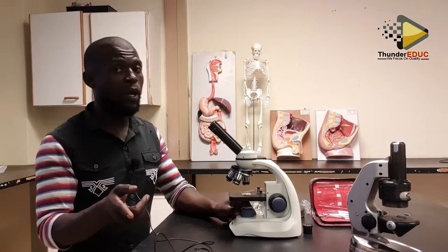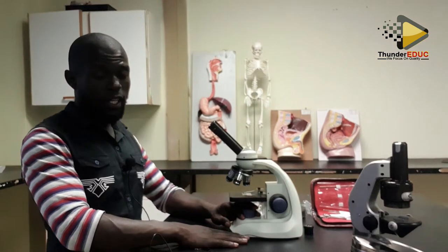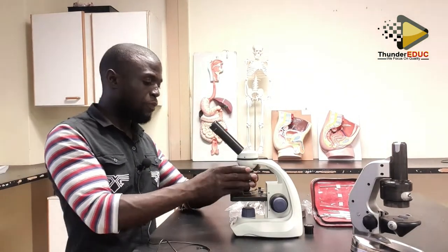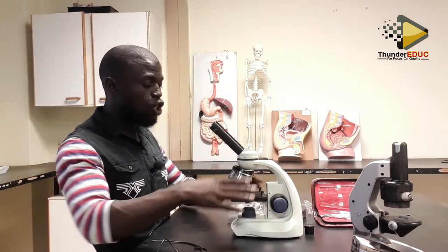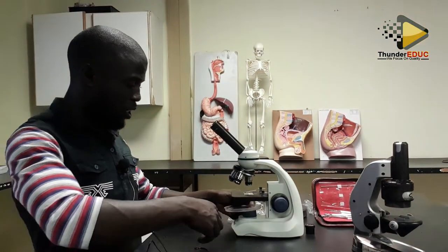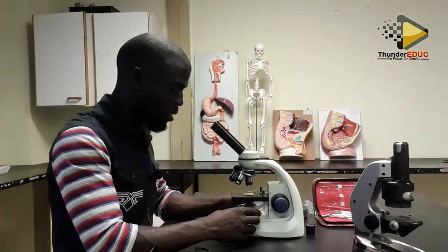The other microscopes I've not spoken about don't have this part of light. We call them dissecting microscopes. These ones can be used even to view objects which are moving, while the others we use to view objects which are stationary. They have the same things, the eyepiece and the objective. When it comes to the stage, it's like a dish, or just a plain stage where you put your petri dish, where you view your objects from. Let me show you the dish I'm talking about. Your petri dish can look like this, and then you put it there and you are able to see the object.